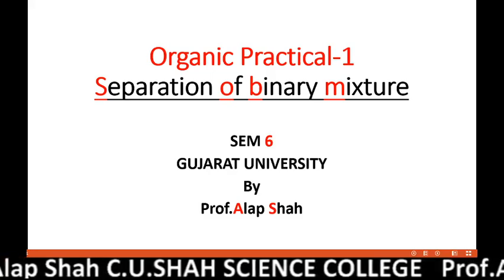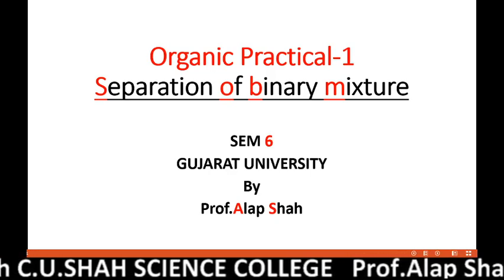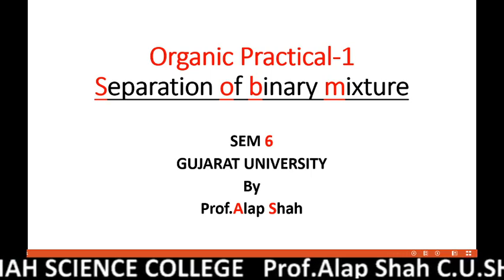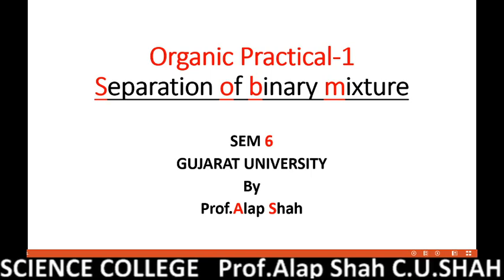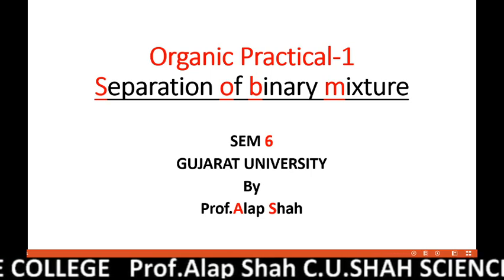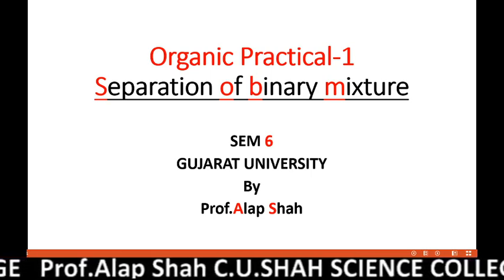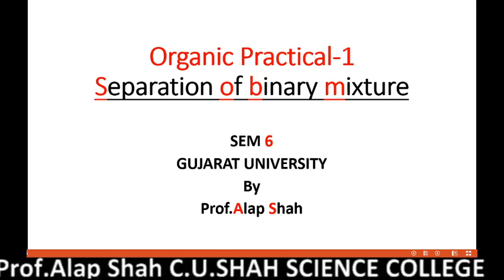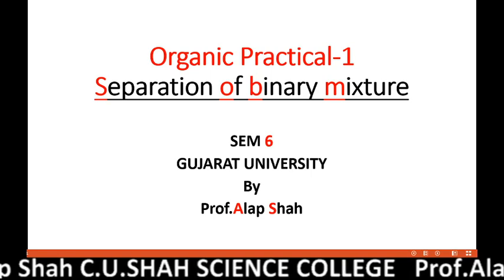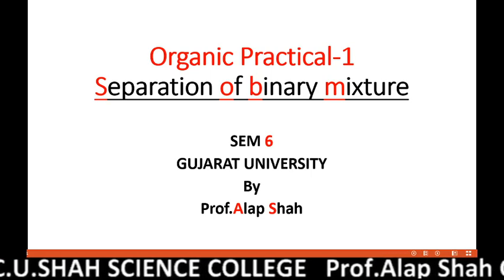Hello everyone, dear students. In the Gujarat University curriculum, in semester 6, particularly in the category of organic practical, there is an exercise called separation of binary mixture. Now you all are familiar with qualitative analysis of organic substance because you have performed that in semester 2 and semester 4, particularly Gujarat University students. So, here in semester 6, you will be given a binary mixture. It means that the mixture of two substances. So, first of all, you have to separate them, and after separation, you have to perform qualitative analysis of both the substances. It means that you have to identify both the substances.